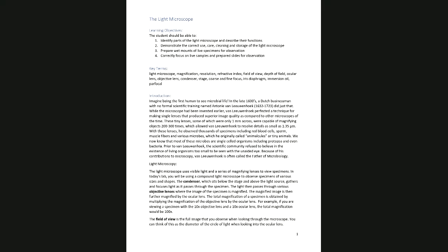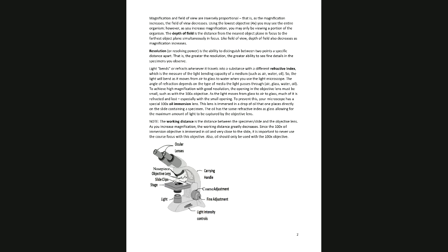And we're going to go over the concept of field of view, right? Because you're familiar with field of view, the whole circular area that you see. And who can tell me what happens to the field of view as you increase magnification? It gets smaller, right? As you increase magnification, the diameter of the field of view gets smaller.